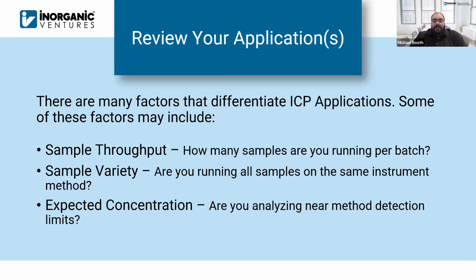What's the overall experience of you or your analysts, and what's their comfortability level with preparing standards? That's something to keep in mind. So there are other factors that go along with these different applications that are more on a global, lab-based level at the same time. So all those factors you want to keep in mind as you select an appropriate standard.